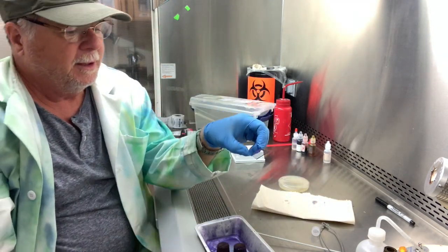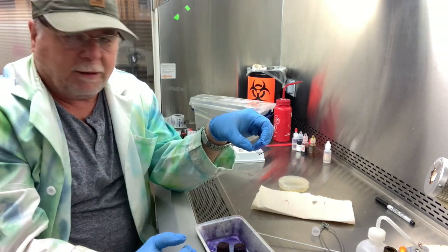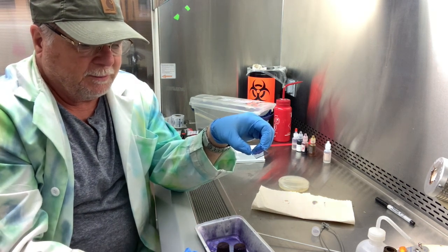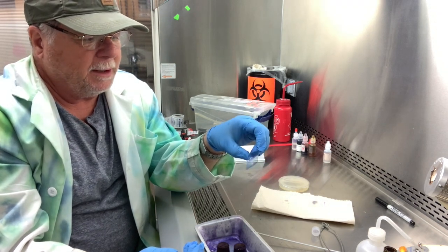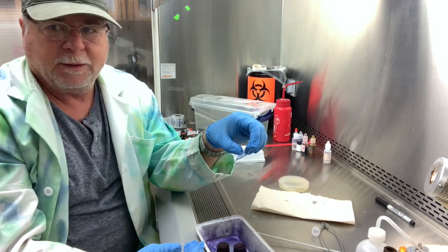And then that'll sop up the water, and now we have our smear that is done. So this is a simple stain because we only use one color of dye, and we have two choices. We have Crystal Violet, or we can color it with Safranin. But this is ready to go, and it goes onto the microscope. So in part 2, we'll put it on a microscope and view it.